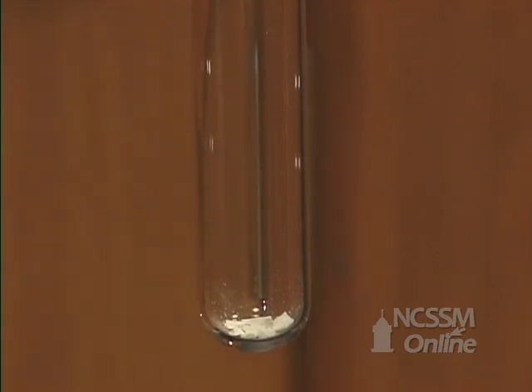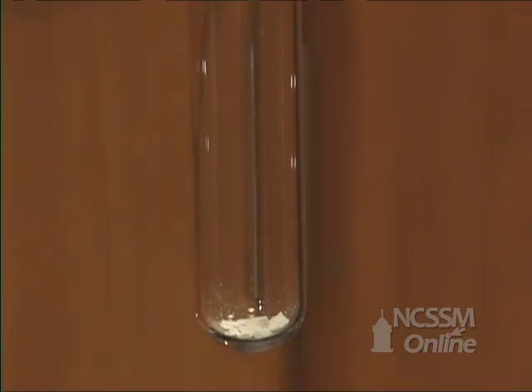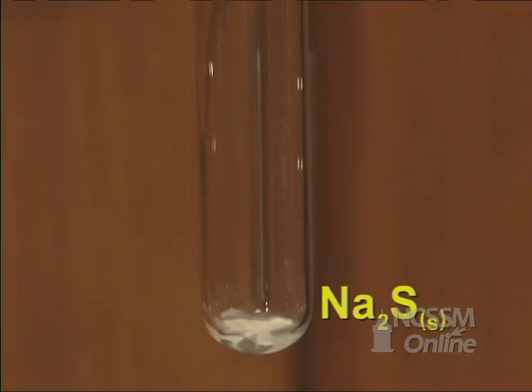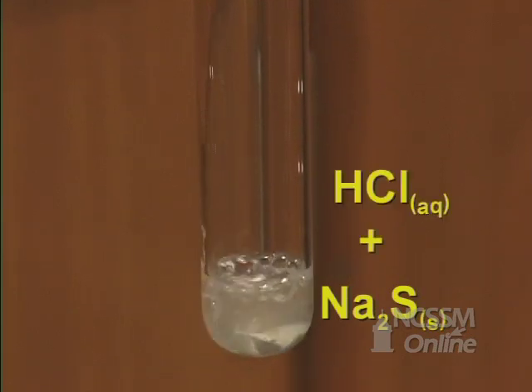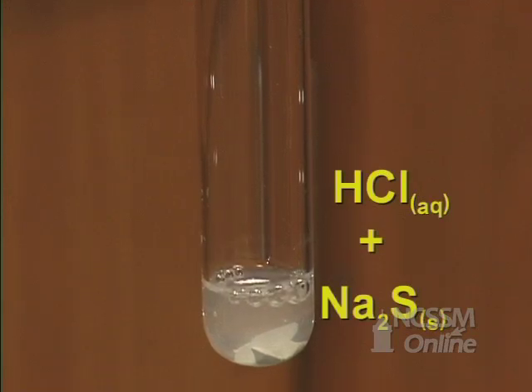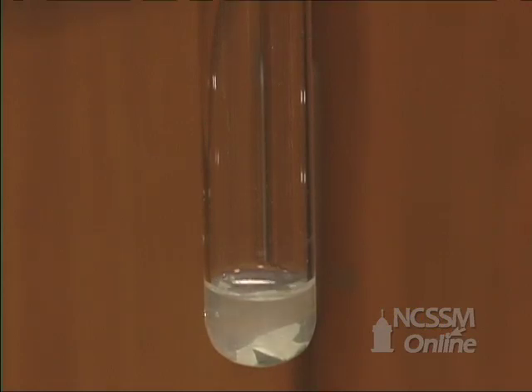In the double displacement reaction of a metal sulfide with an acid, we'll start out with a small amount of sodium sulfide. We'll add an aqueous solution of hydrochloric acid. The sodium sulfide and hydrochloric acid react to produce hydrogen sulfide.